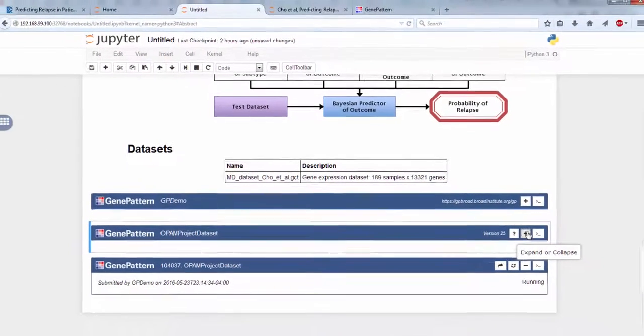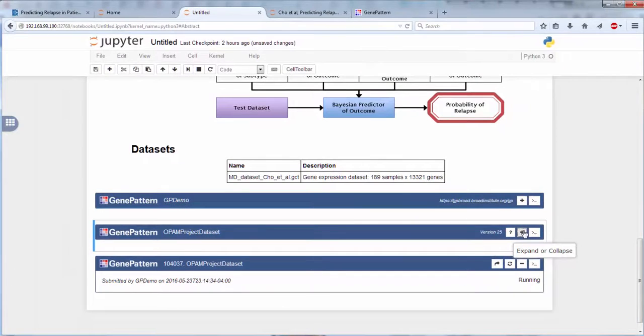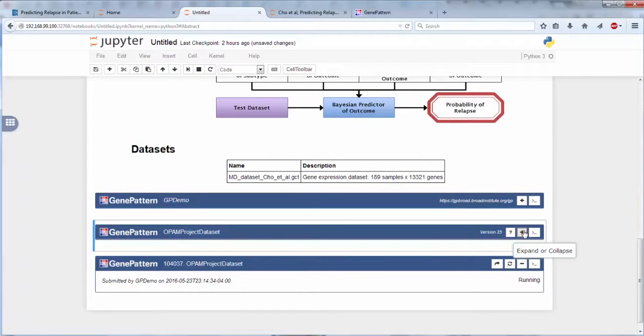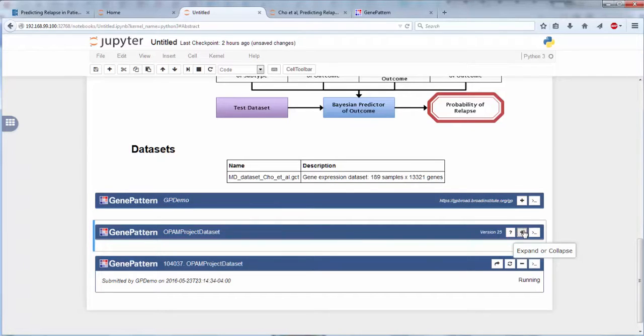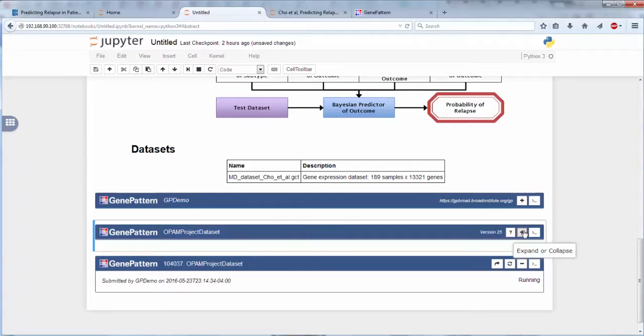Once the module has finished running, the results can be sent to other GenePattern cells using the UI, or can be accessed by programming users via Python, just as you would use any other Jupyter notebook results. This is another way in which GenePattern analyses integrate seamlessly into the flow of a notebook.